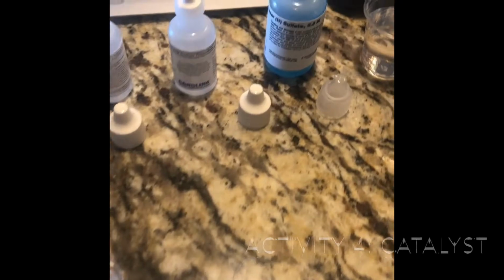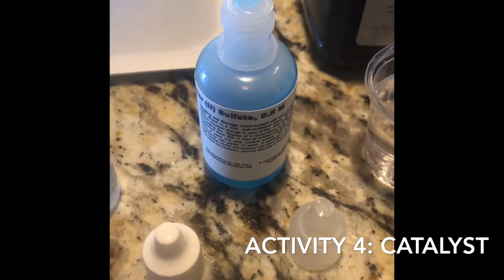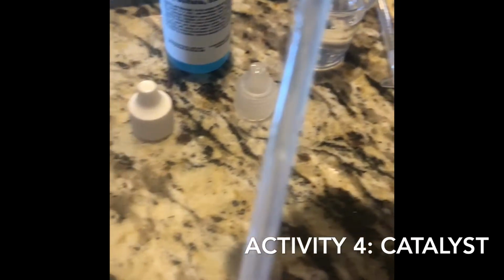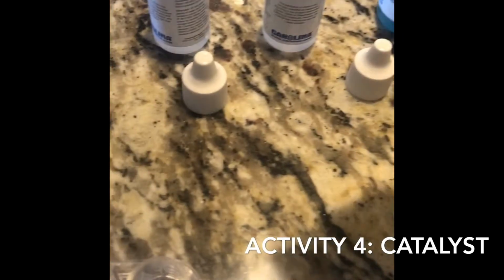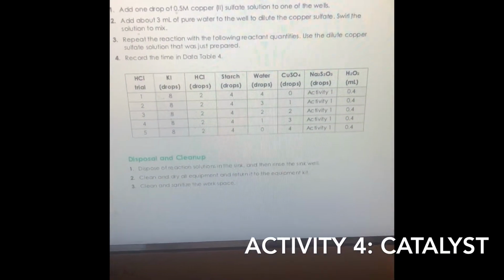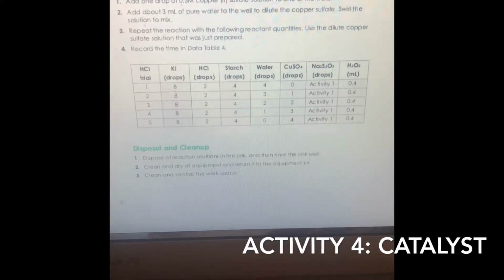Okay, so activity 4, the catalyst. We need 1 drop of copper(II) sulfate, 0.5 molar, and then of course 3 mL of pure water. I put that in the well, mixed it up, and then added it to my syringe so I could drop easier. What we're gonna do is that chart right there. So we will add 0 to 4 of the copper mixture, and then we'll do those trials and see what happens.